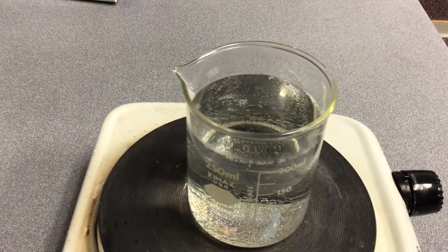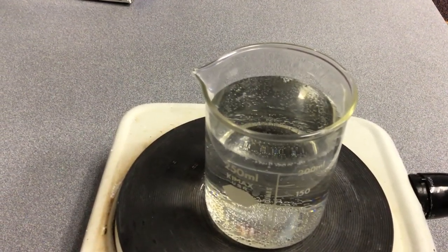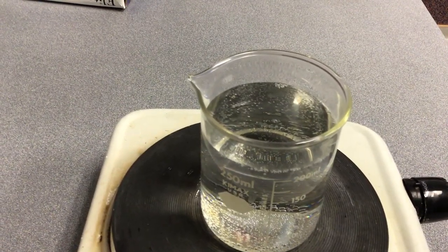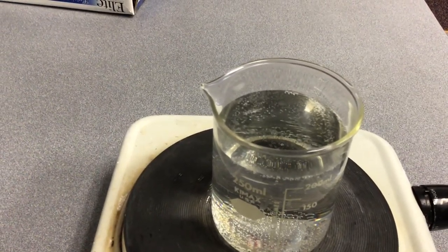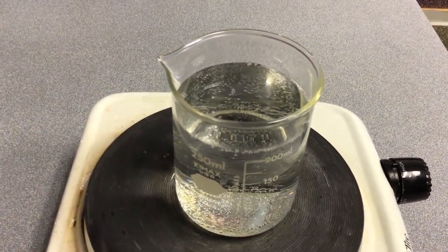then you'll be able to use that to, on the back side, write if a physical change or a chemical change is occurring, and then provide your evidence. There is a change happening there, and we've talked about it in the physical chemical change things.